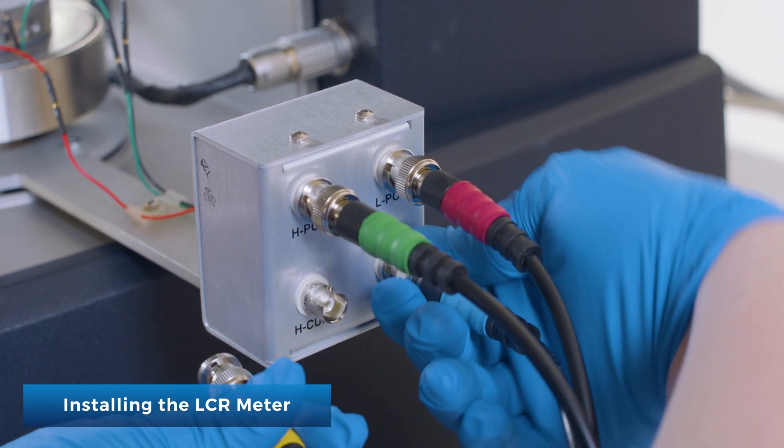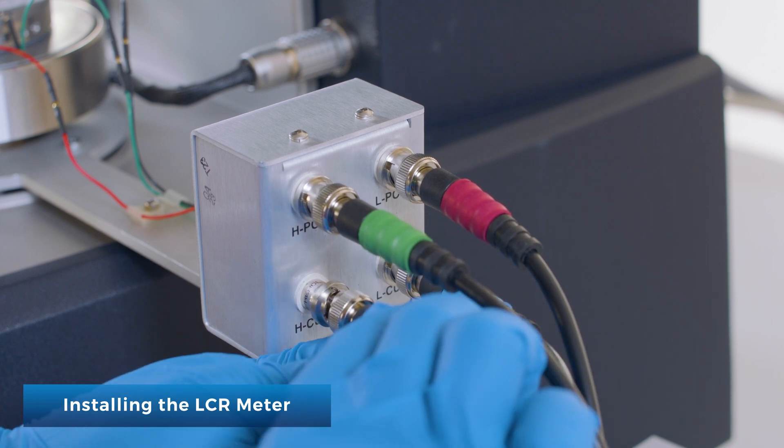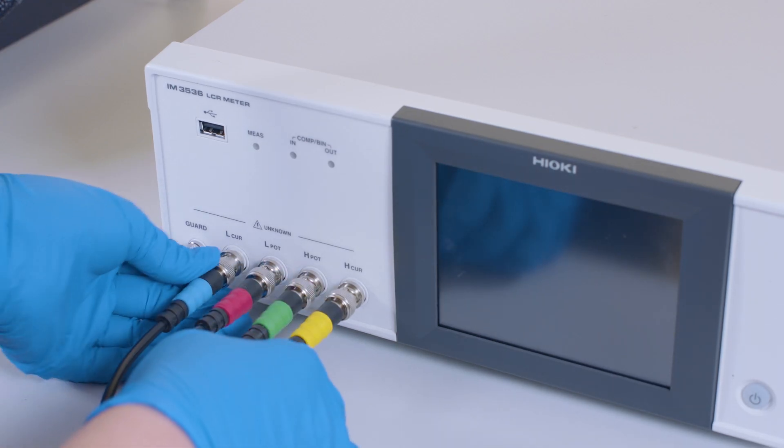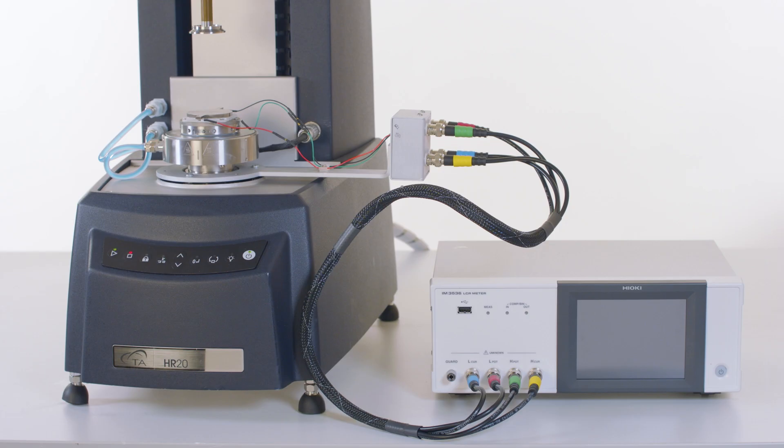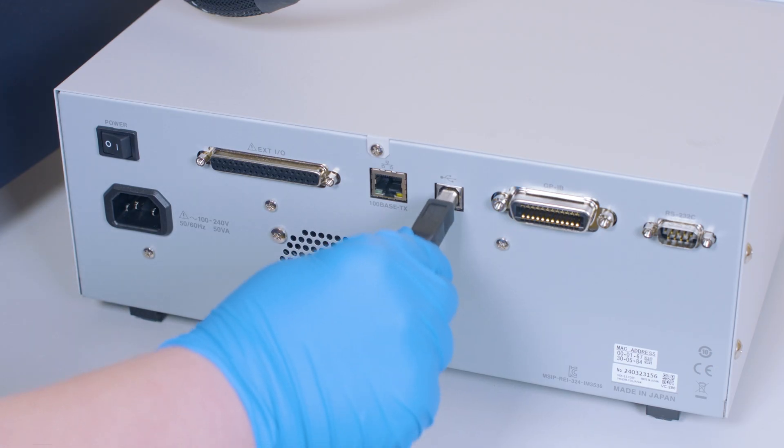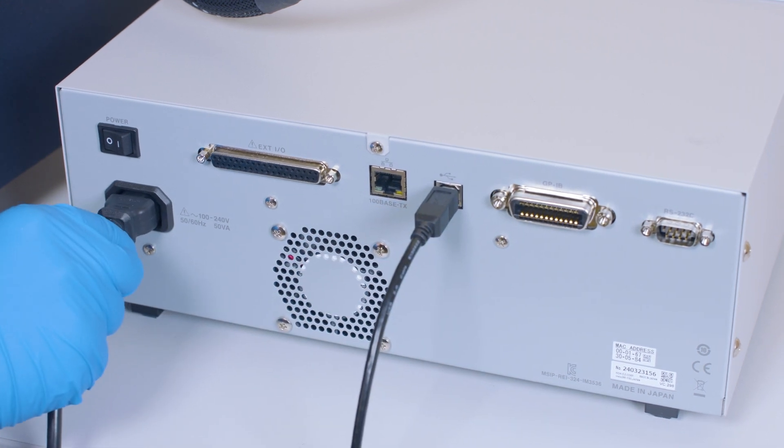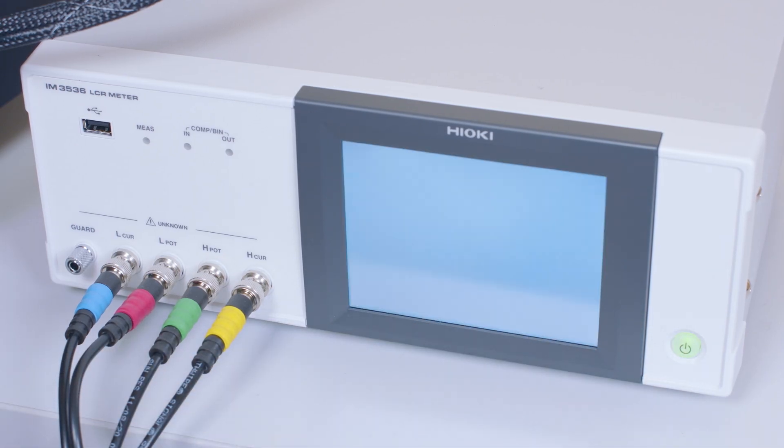Connect the coaxial cables from the junction box to the LC meter front panel. The cables are color-coded so that corresponding signals may be matched between the junction box and LCR meter. Connect the USB cable from the back of the LCR meter to the computer. Plug the LCR power cable into a power source. With TRIOS running, turn the LCR meter power on.